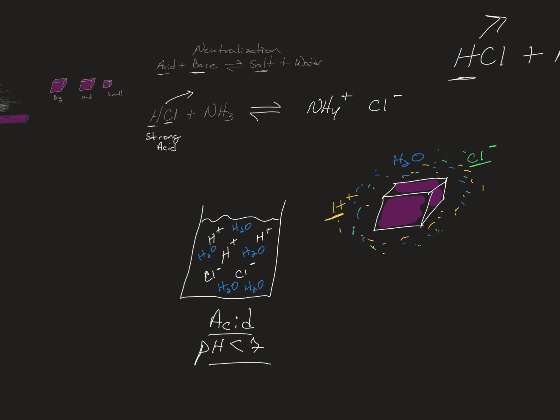The big point here is diffusion. All this other stuff is how we see diffusion. How do we see diffusion? Well, you're about to see it. You have to understand the idea that as the hydrogen ions go into the gel, what's going to happen? It's going to neutralize the base, and then what happens? It reaches equilibrium. Well, that's correct.